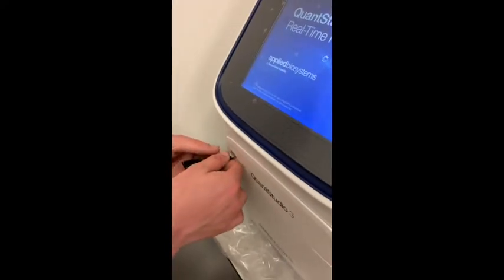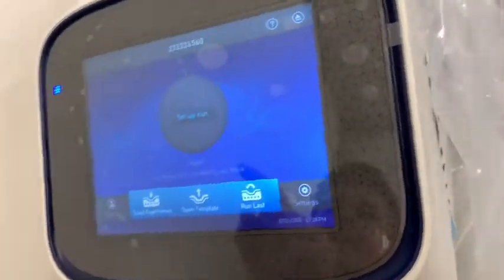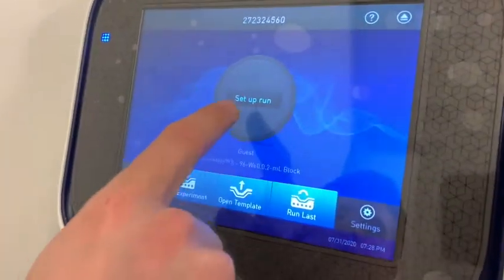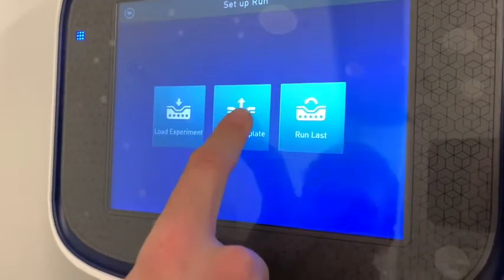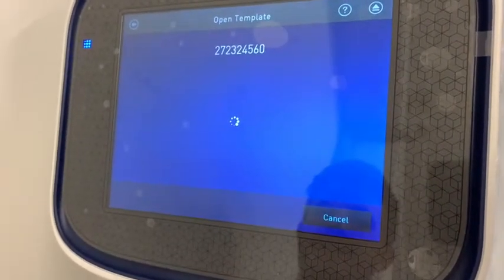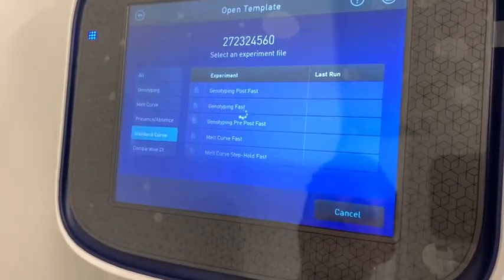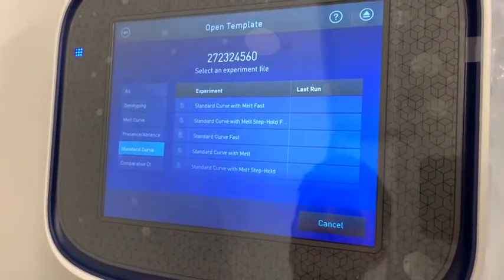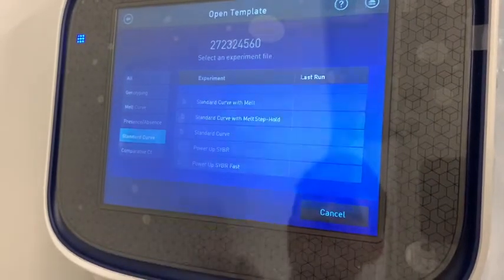Welcome to the QuantStudio setup video. Click on Setup Run, then Open Template. Go to Standard Curve and scroll down to Standard Curve.